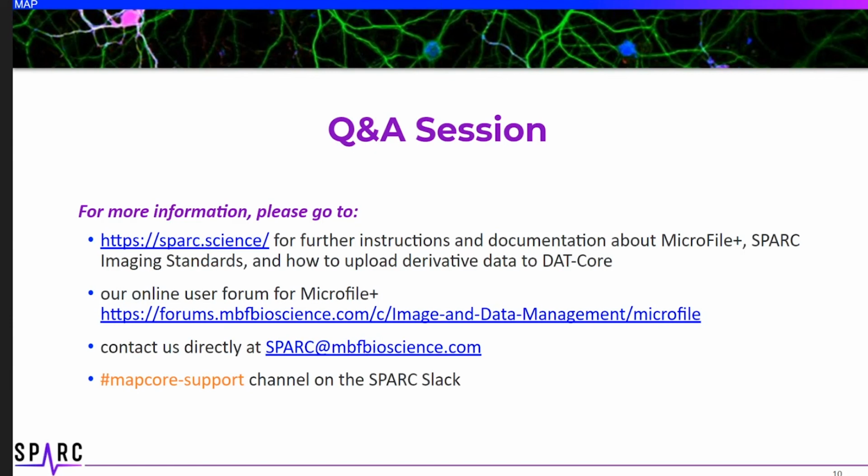I'm not sure exactly what Photoshop utilizes for metadata fields when they are saving data, if they're using the entire structure that's available in the spec, but the OME TIFF does. I often see that when you save as TIFF in Photoshop, you oftentimes lose the scaling if it is already embedded. So the OME TIFF will keep that information with the file itself.